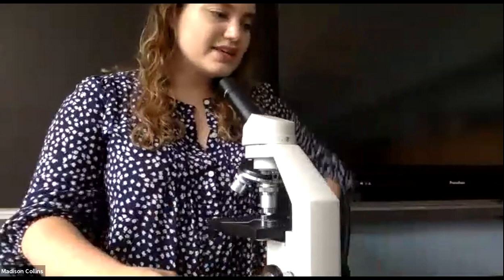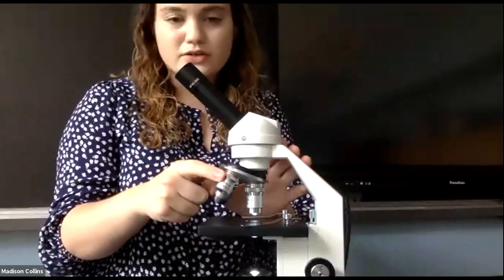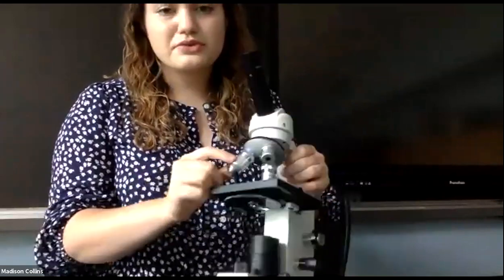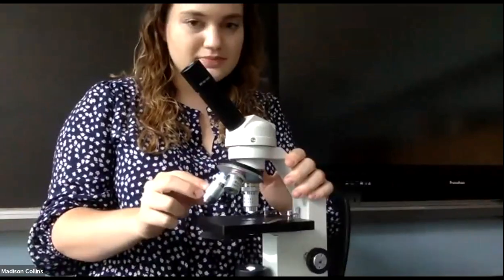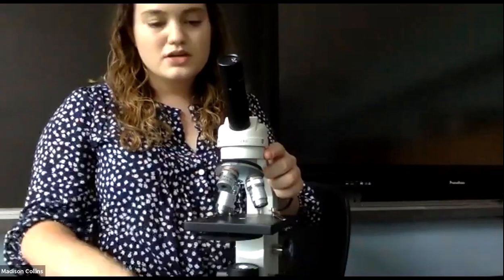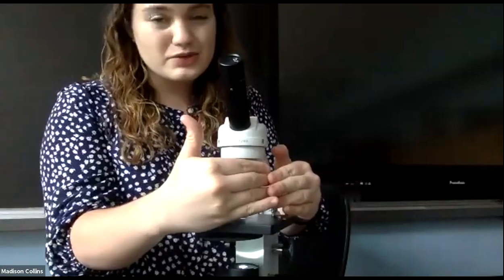Right? The next thing on your paper is the revolving nose piece. If you look right here on your microscope, this is going to be your revolving nose piece. It rotates, so you're able to switch between lenses. So it actually houses 3 separate lenses that we're going to call objective lenses. Okay? Now, we see that there are 3 objective lenses here, but we're actually only going to use 2. So this lens right here that has a red ring around it, I want you to pretend like that does not exist, because we're never going to use it.